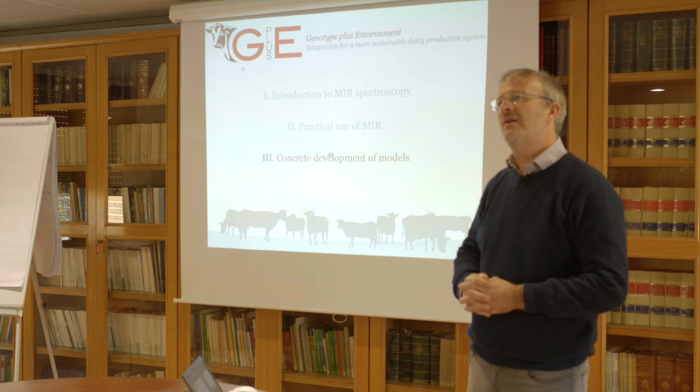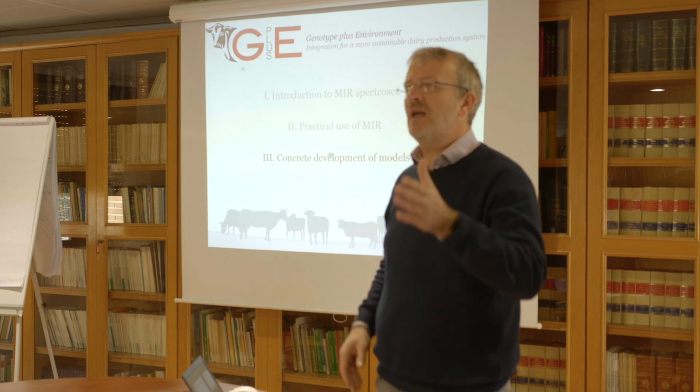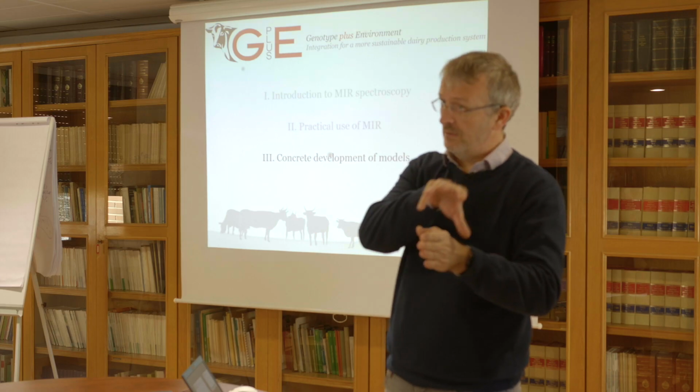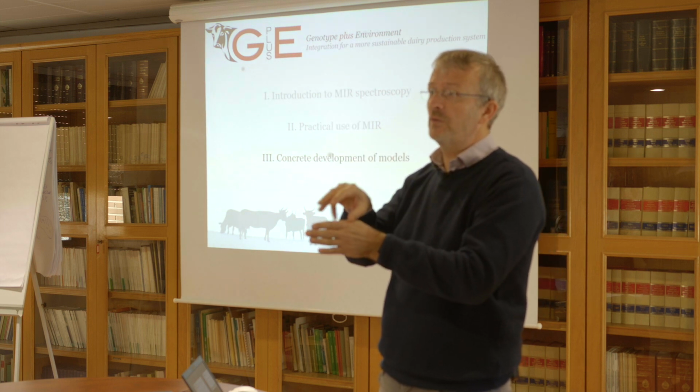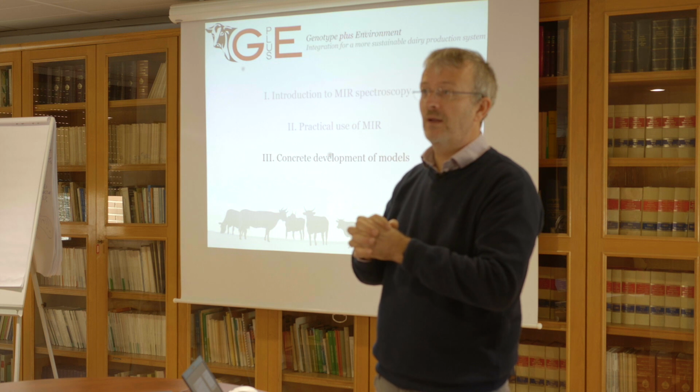Do you understand? Yeah, but if you want to work in an experiment that you have measures over time in different moments, I think that you should try to standardize all the measures for the condition at the beginning in the master collection, is that right or not? Yes, but it's not important. For example, if your experiment starts at the month 1, and you measure at the month 2 and month 3 and month 4, you need to correct your coefficient by using the coefficient created in the month 1 for the samples of the month 1, and the coefficient of the month 2 for the month 2, and the month 3, and so on. For that, you need to use the same samples that you used in the first time?